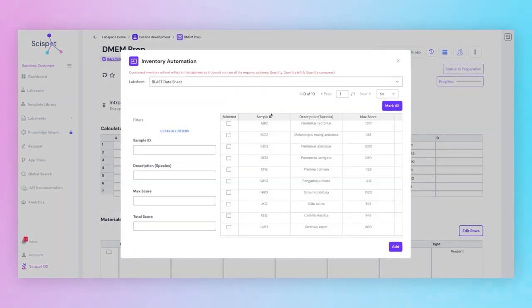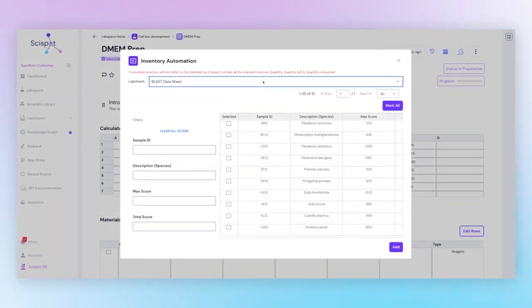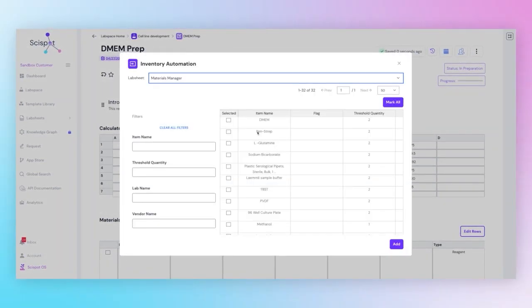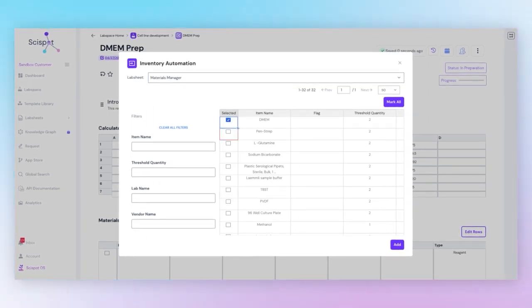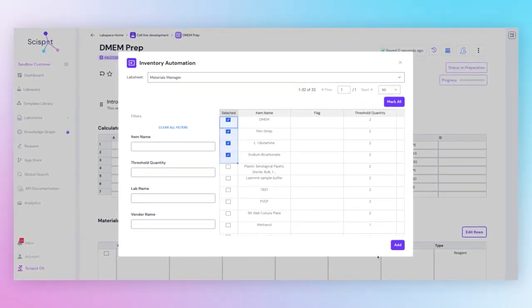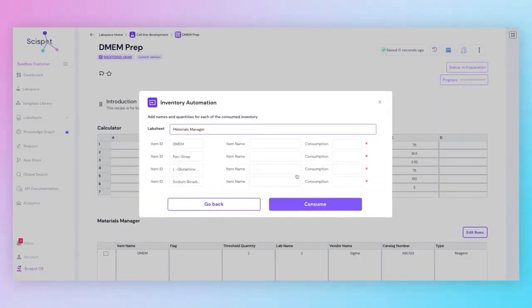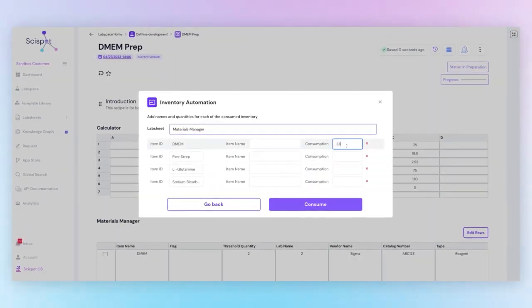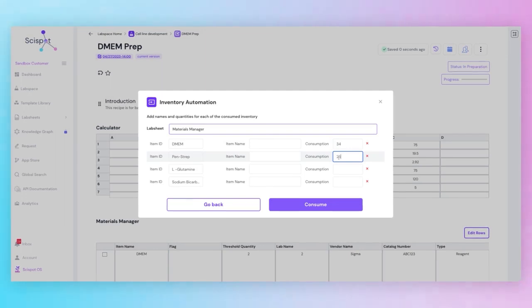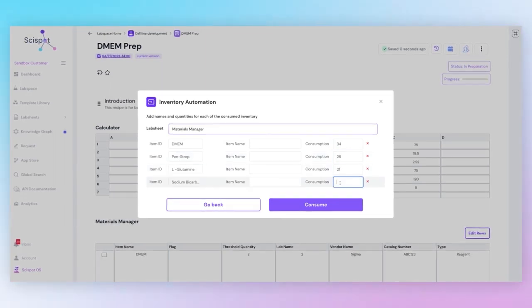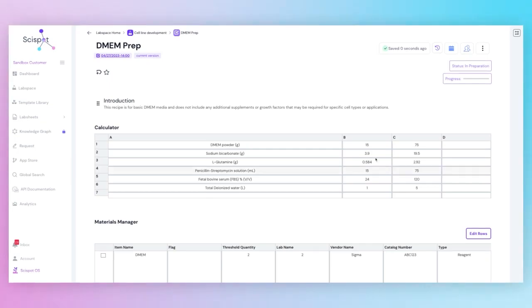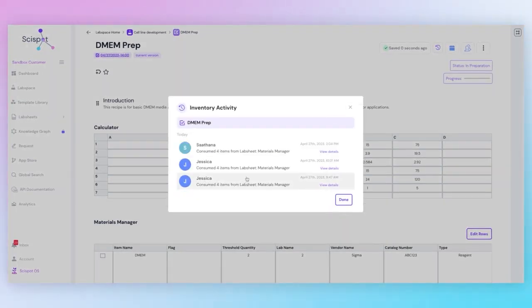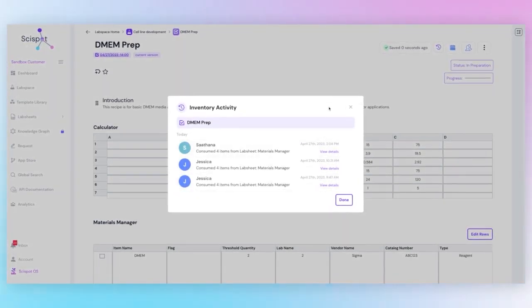You can select a lab sheet with your master lab sheet with all your inventory. Like so. Select as many items as you've consumed. You can choose to add a name or simply write down the number or amount that you have consumed. Click Consume, Confirm, and it will be updated in this inventory activity.